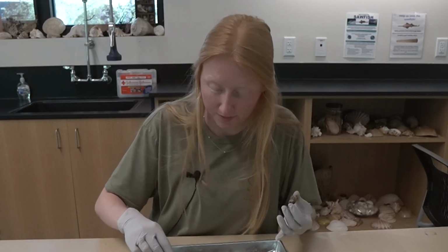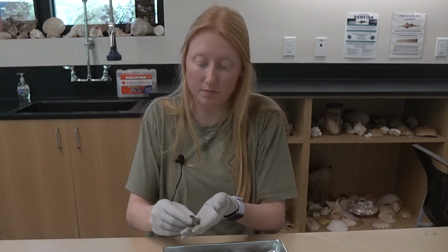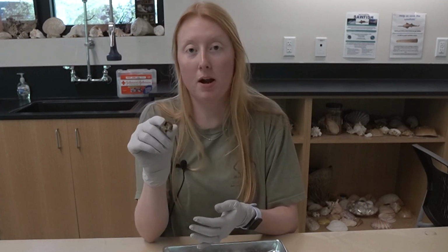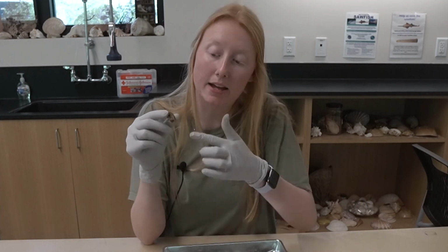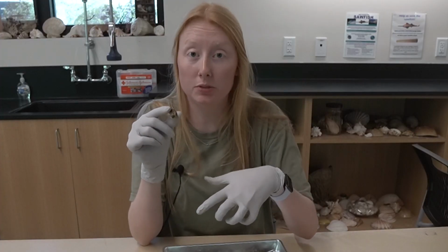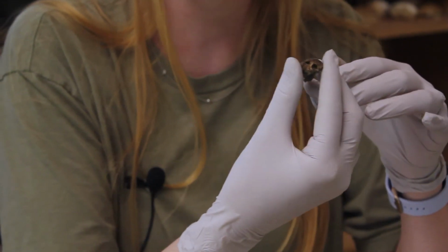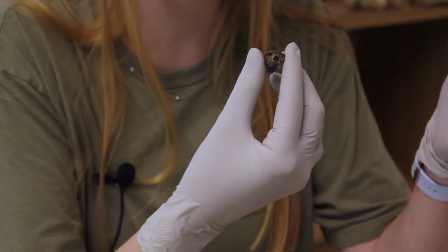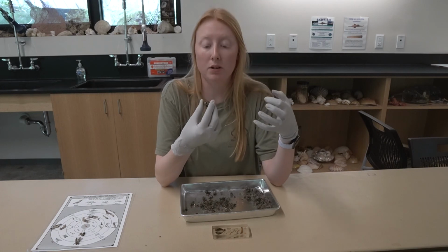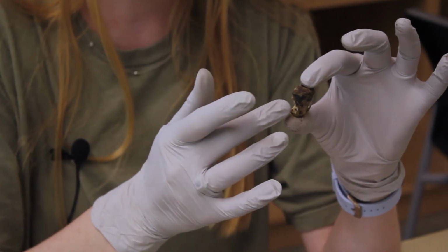Aha, okay. I think that is about as good as it's going to get on the skull. This is going to be the top part of this rodent's head. I tore off those two front orange teeth, but I did show you earlier, so that's how I know it's a rodent, because of those two large front teeth. If we turn it around, we can see the little hole where the brainstem would be, where the vertebral column would connect, so its backbone would connect. These two large sockets right here would be where the eyes would go.